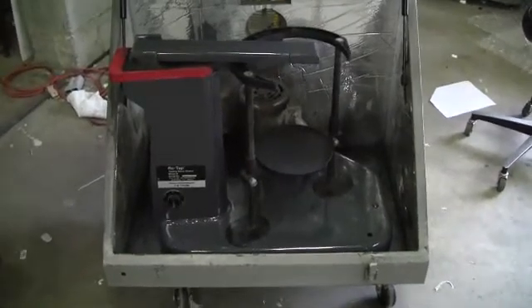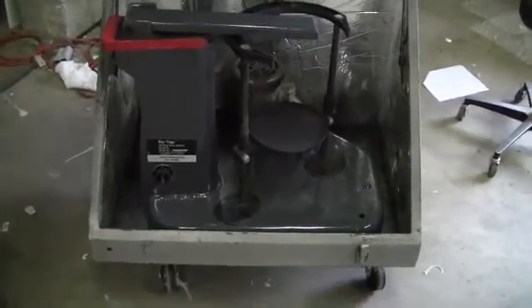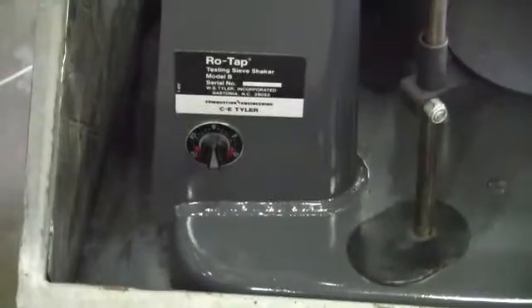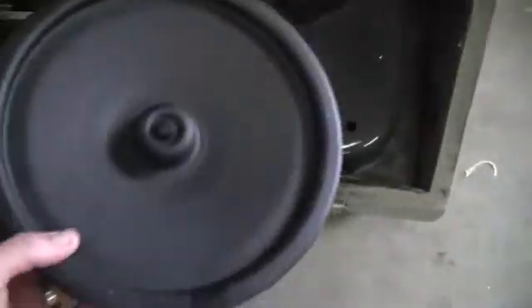Good afternoon from Hitech Trader. This is the Rotap machine, model B, with a simple timer. It's where you stack your sieves. Here's the top of the unit with the rubber cork.